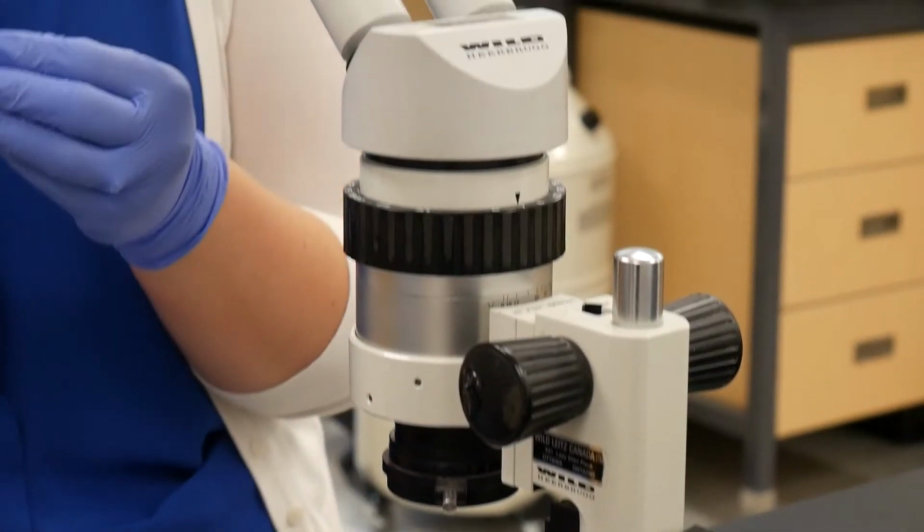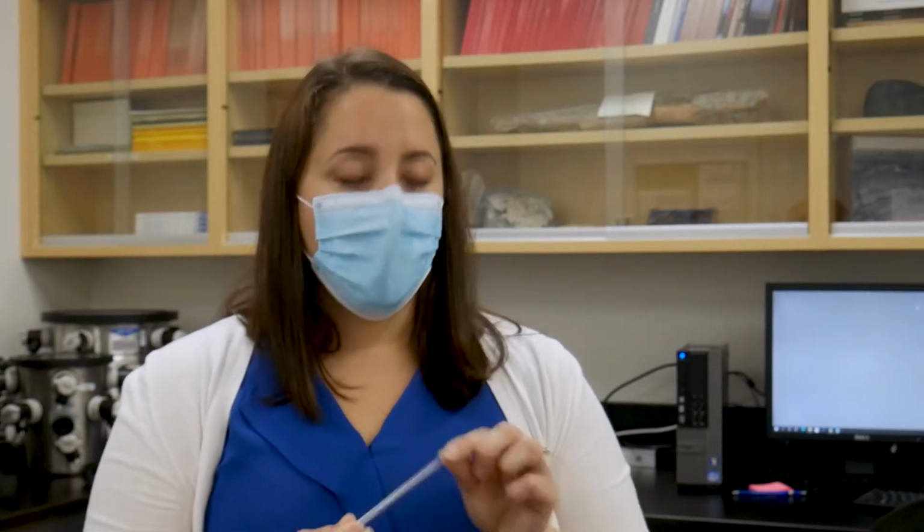Following chemical pretreatment, once the sample is fully cleaned up and we're just targeting the piece that we're interested in dating, the sample would go through combustion. So we convert the solid material into gaseous CO2 in purified form. So that would be stored in a glass ampule under vacuum, quantified and cleaned up. So all of our samples go through this stage to CO2.